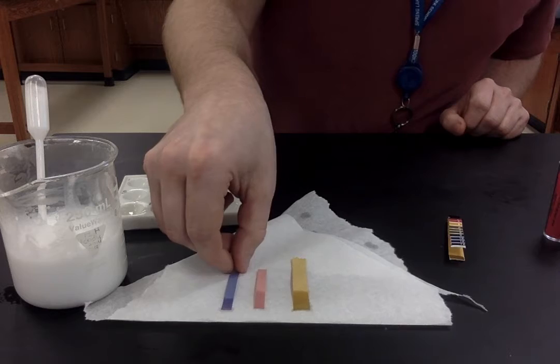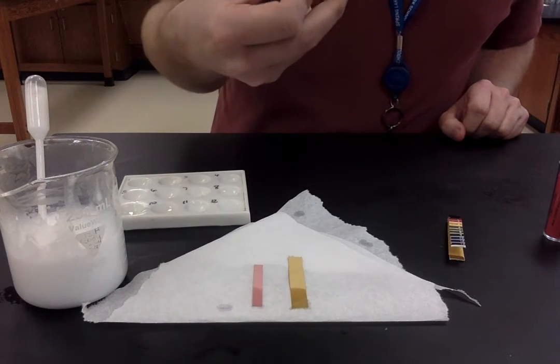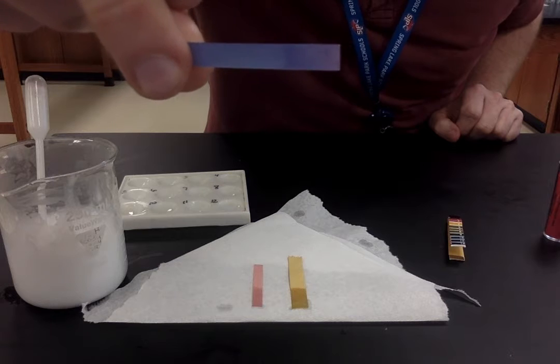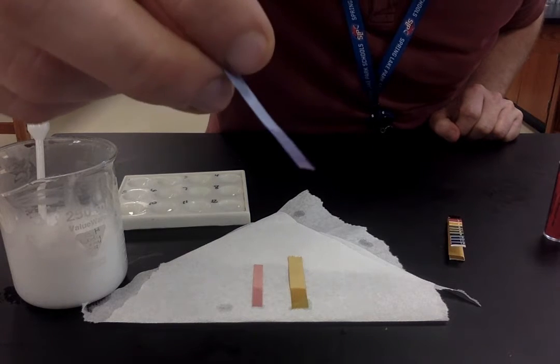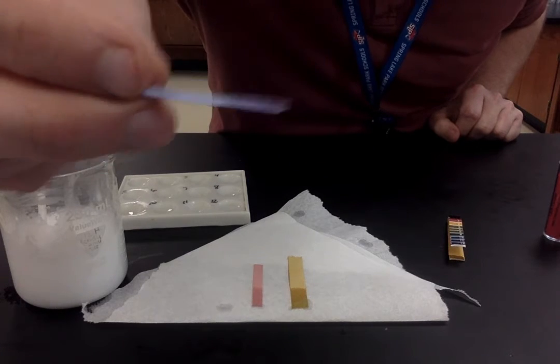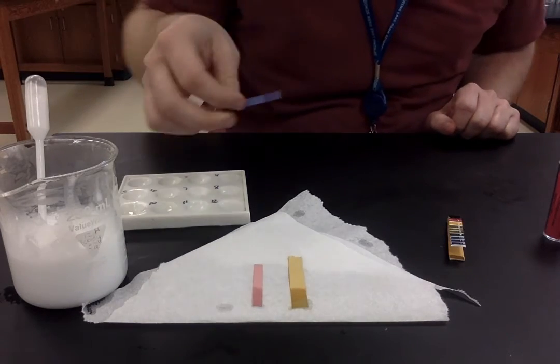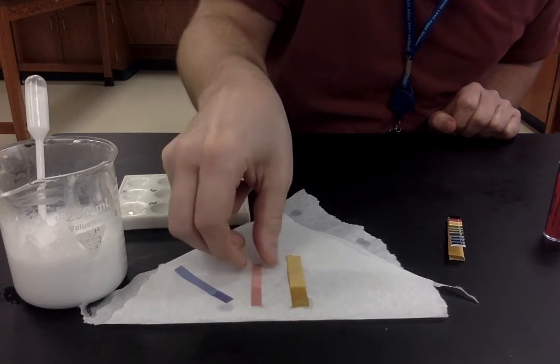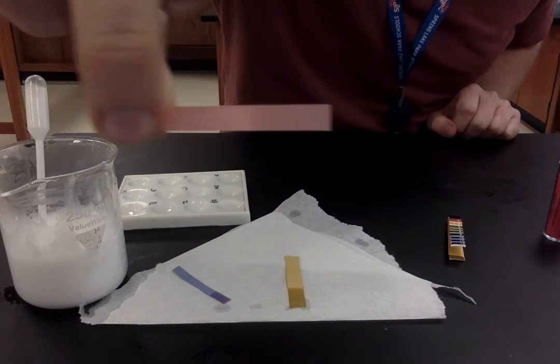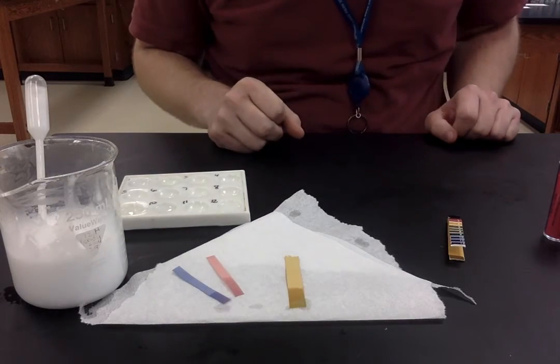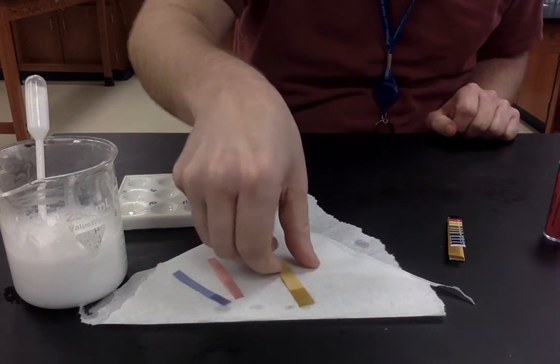Okay, so first up is the blue litmus paper. You can kind of see when I hold that up there, it's mostly still blue, maybe slightly red on the end here, but mostly still blue. So you write down blue. Red litmus paper is red. So think about it: if it's blue and red, what type of thing is that? Is that acid, base, or neutral compound?